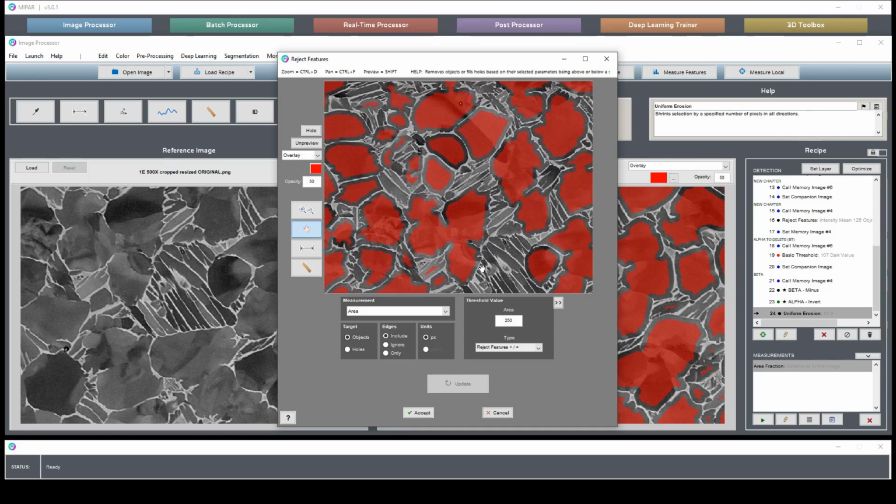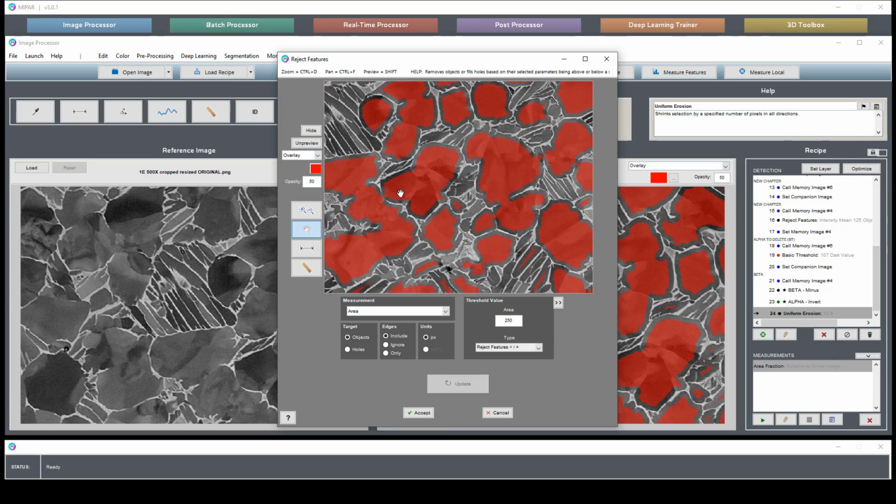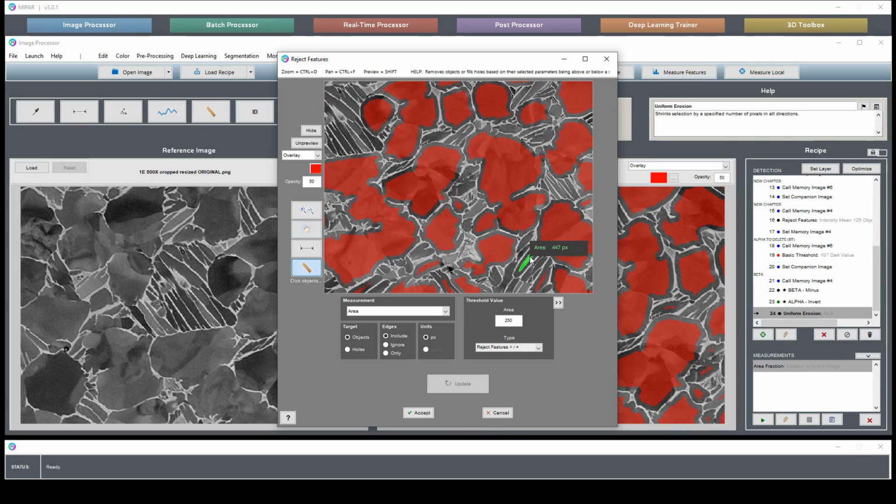These big pieces while still keep removing a lot of these more elongated ones. I think we still want removed 400. Okay, so if we set our threshold here back to 500.